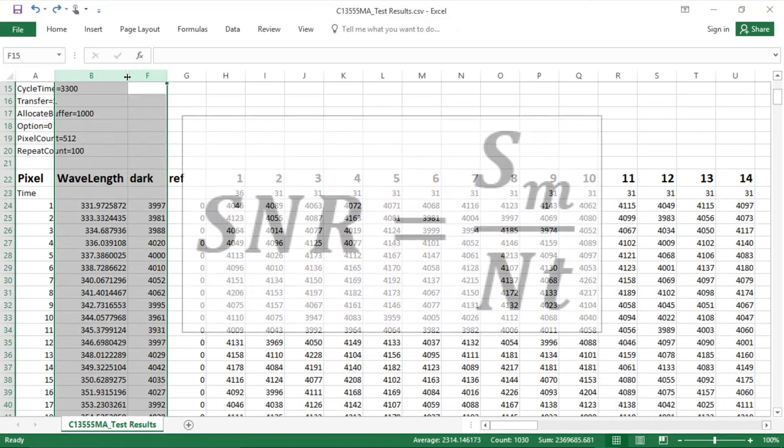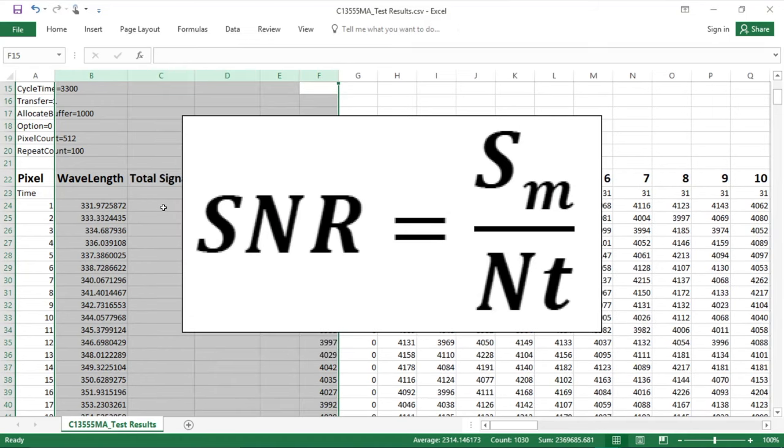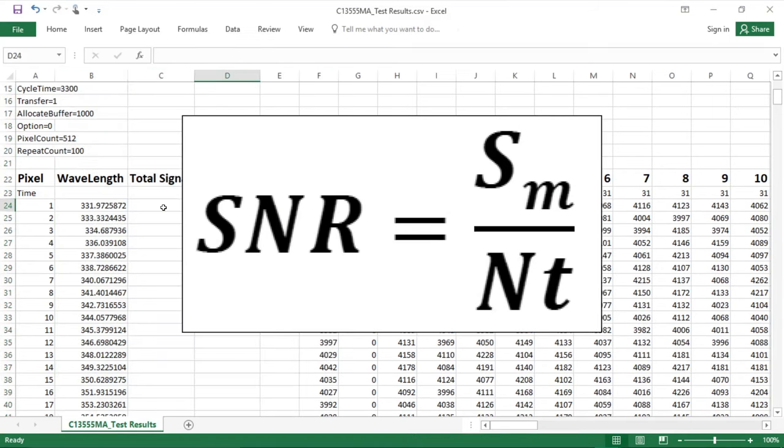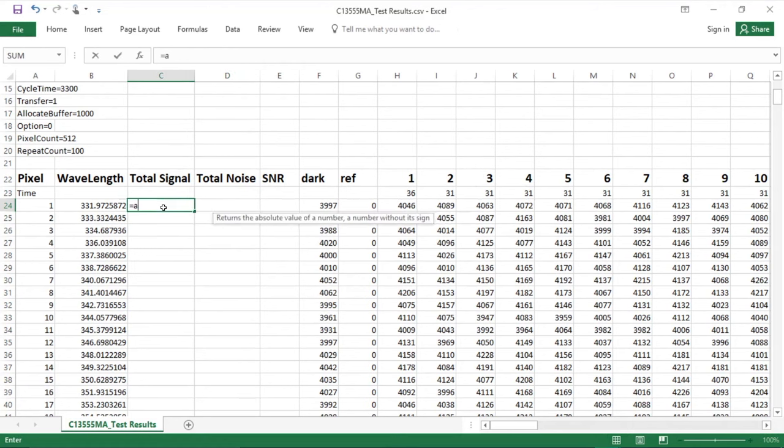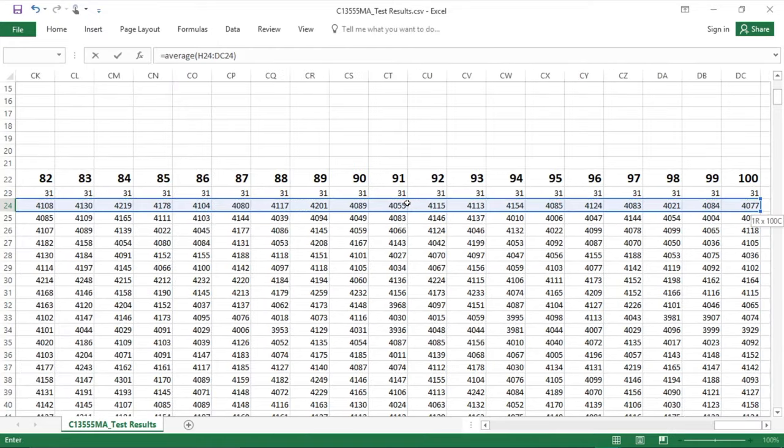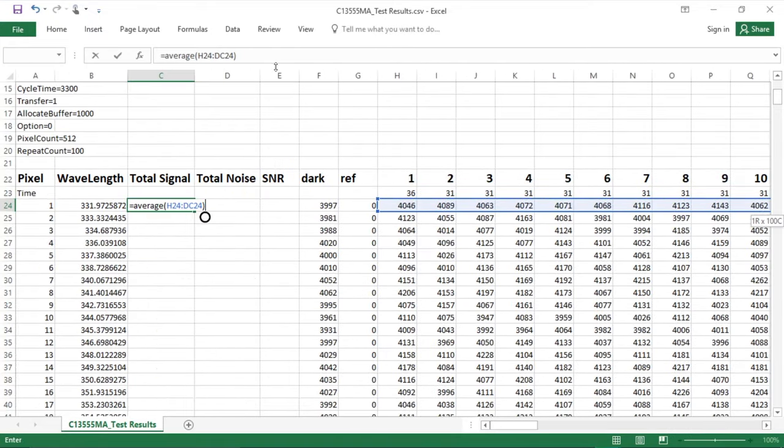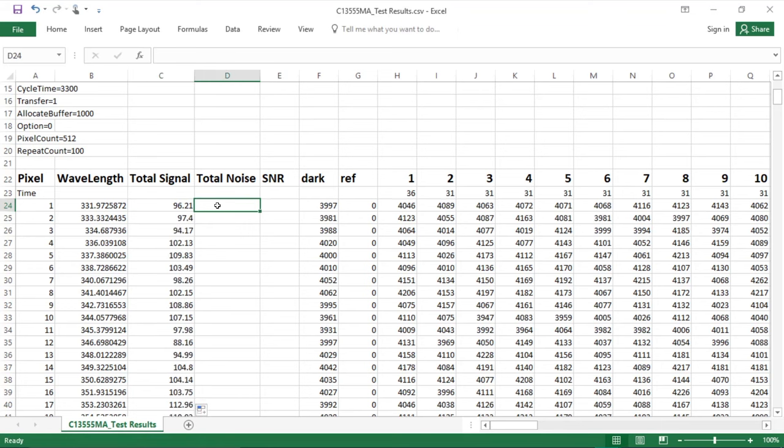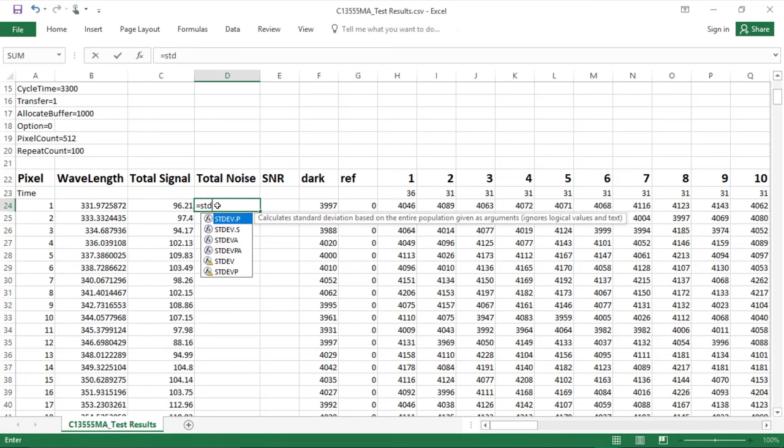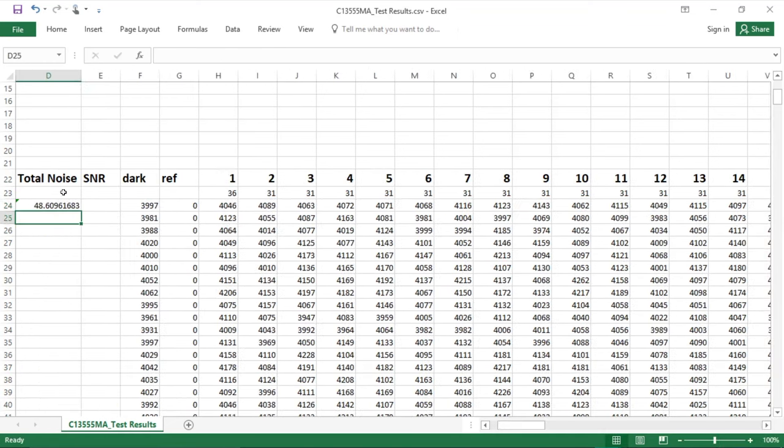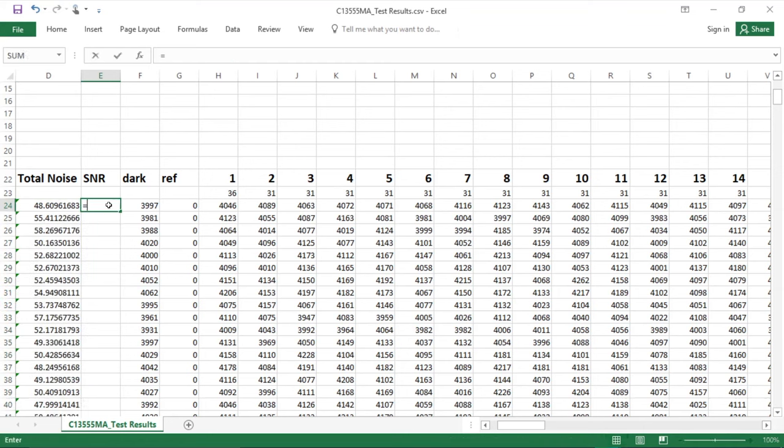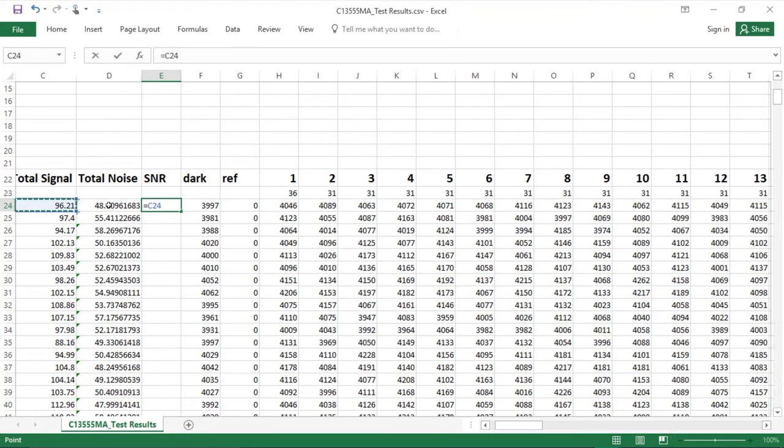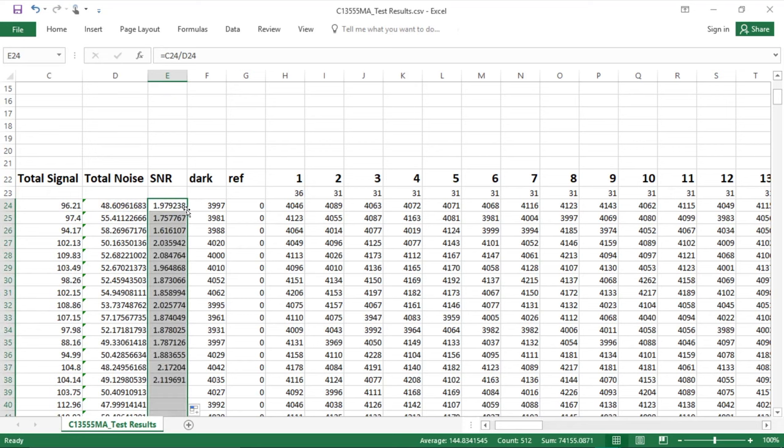So to calculate SNR, we'll recall that SNR equals total signal divided by total noise. To calculate the total signal, we'll take the average across all 100 light measurement scans. From this average, we'll take the dark noise and subtract it out. We'll then apply this across all of the wavelengths. For the total noise, we'll take the standard deviation across all 100 light measurement scans. And just as before, apply this across all of the wavelengths. Now to calculate SNR, all we need to do is simply take the total signal and divide the total noise. And apply this again across all of the wavelengths.